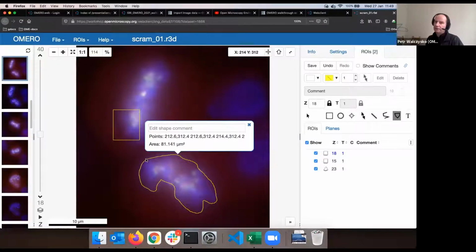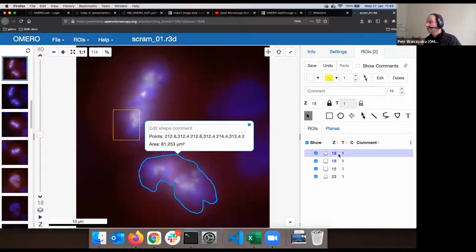Now I can't show you my right hand because it's in use. The mouse button is down. Now I let it go and I let go of the shift, and again a polygon has appeared here in the list, and this is highlighted now like so. Hopefully you understood how to draw a freehand polygon. This was a little bit different than drawing the rectangle.